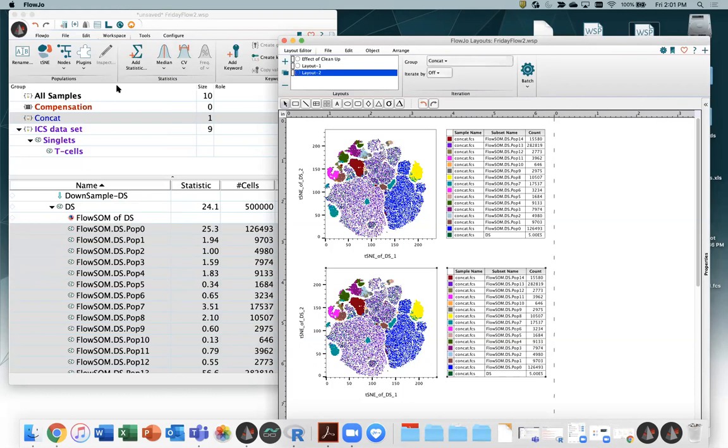I think that's where some of your expertise will really help in trying to decide if the differences you see in some small populations from their nearest neighboring populations are relevant, and where FlowSOM and Phenograph will each have their strengths. Again, Phenograph just not producing small clusters if they don't feel real to it based on the number of nearest neighbors, and FlowSOM being able to very quickly see what are the closest other similar clusters and what their profile is.